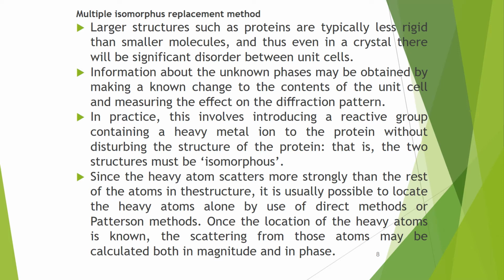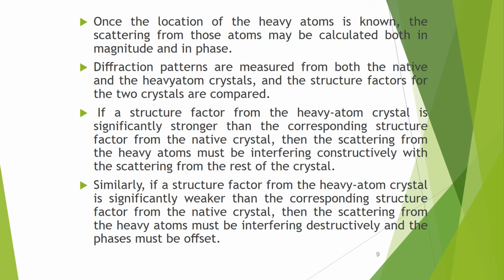Once the location of the heavy atoms is known, the scattering from those atoms may be calculated both in magnitude and in phase.